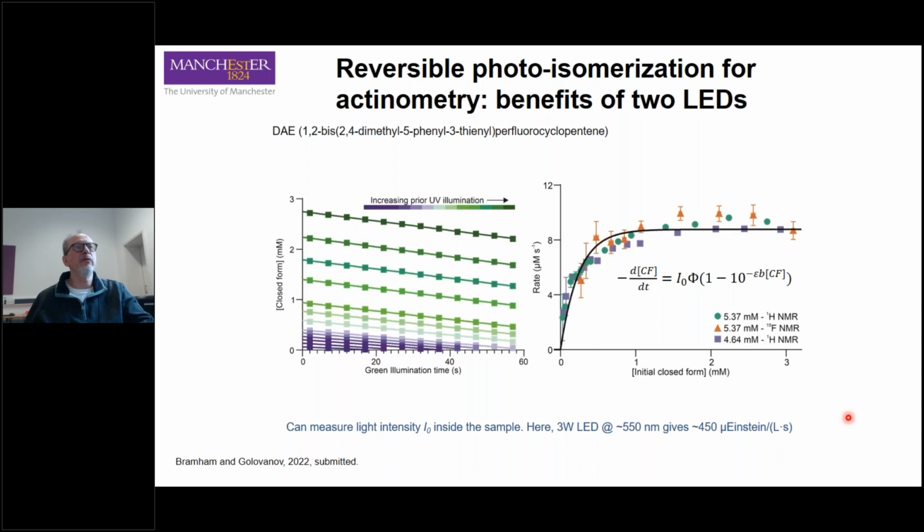Knowing the total sample surface area which is illuminated, we can estimate photon flux density and the irradiance right around the sample. And by the way, as we can see, this number is fairly large compared to what we get from using the traditional fiber optic based setup or what we have seen in the literature.